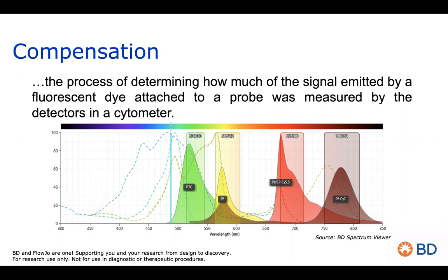If you've got spectral compensation in use here, we would actually lay out those detectors so that we covered as much of the range of light here as possible, as opposed to attempting to line them up to pick up specific colors. So either way, you're trying to identify how much of a specific probe you had on each one of those cells.